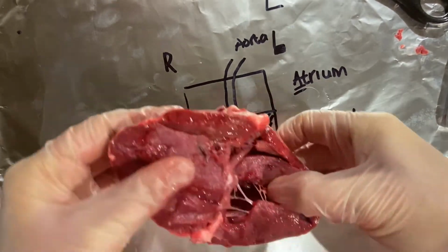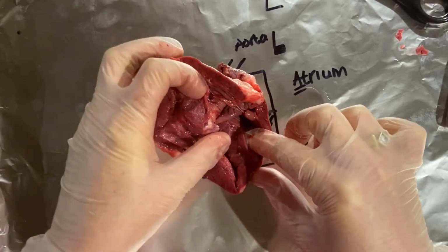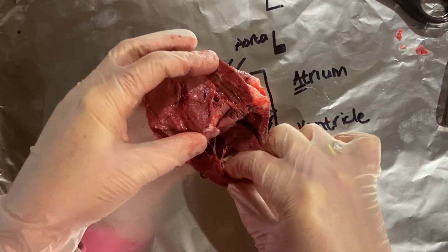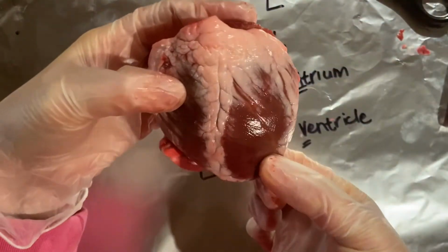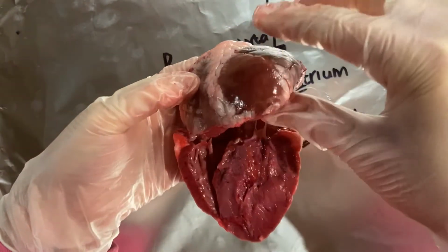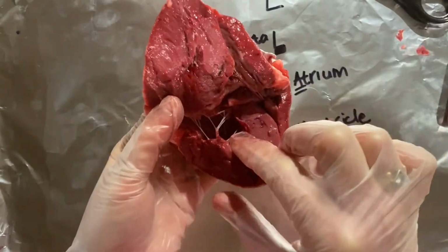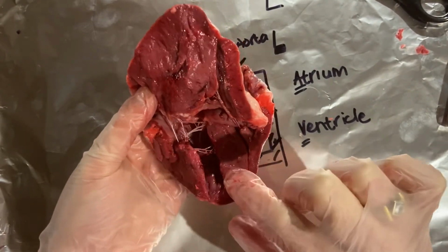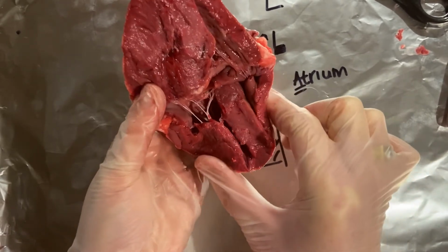Okay, right, so the first thing I'm going to show you is this over here. This part is that nice thick, the left hand side of the heart. So this heart would be like that, okay? And I want to show you the other side, from the other end. So this over here is the left side of my heart, which is going to pump when these ventricles contract.